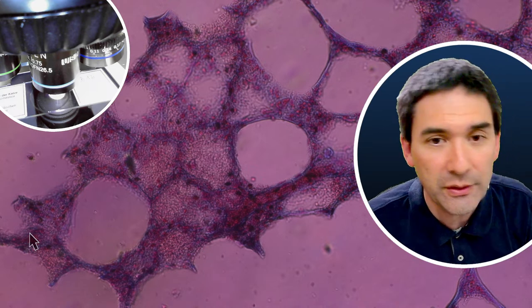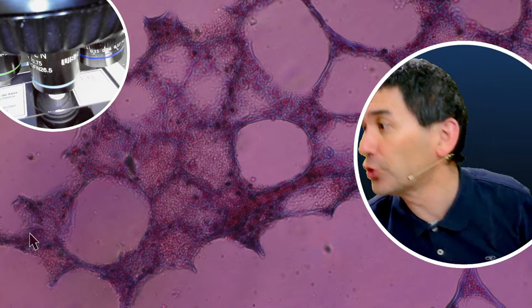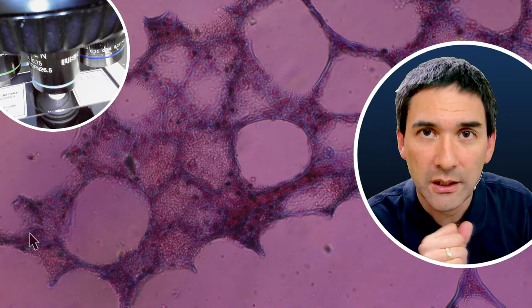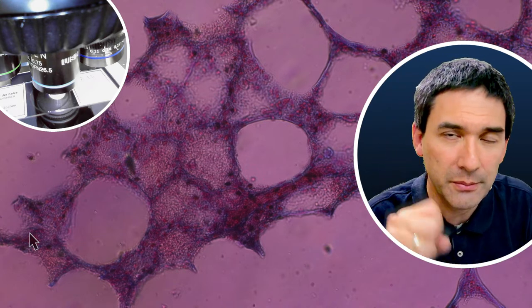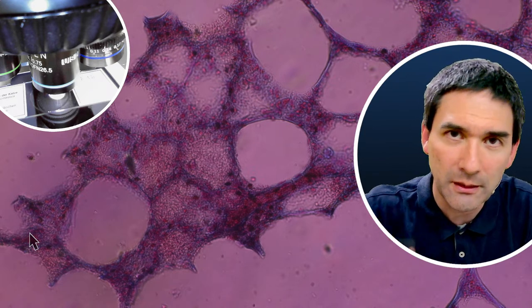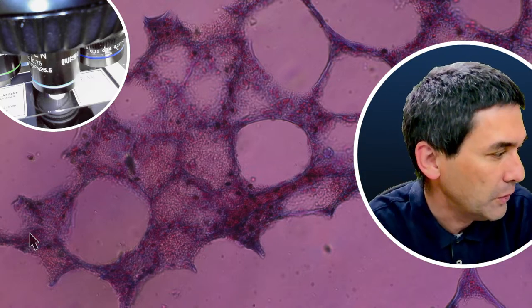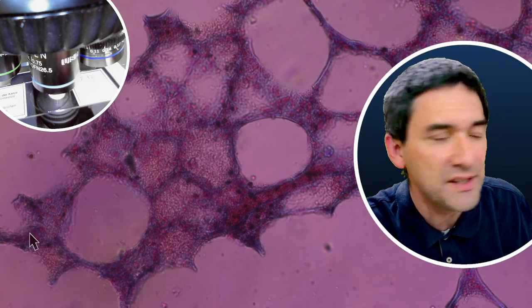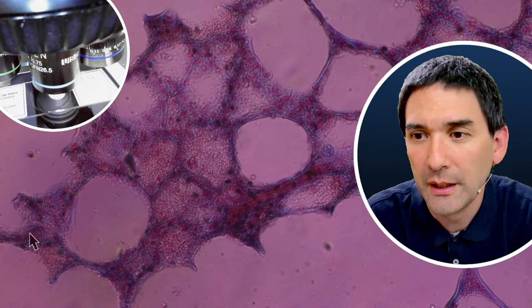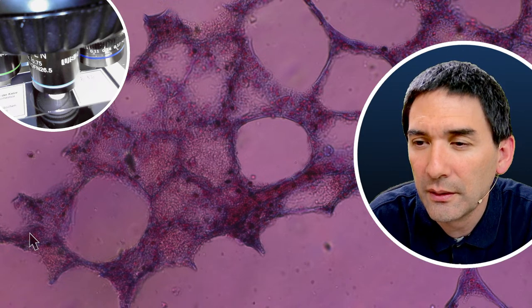Dust is very difficult to avoid. So what I usually do is I use a dust brush, where I don't even know where to put it, to sometimes brush it off. Or some compressed air, but not from a spray can. I basically pump up a bottle with a bicycle pump, and this compressed air gives some puffs of air that I'm able to clean off also some of the dust. And the stage, I occasionally wipe it off using some moist tissue paper. So that's essentially all I'm doing. Okay.